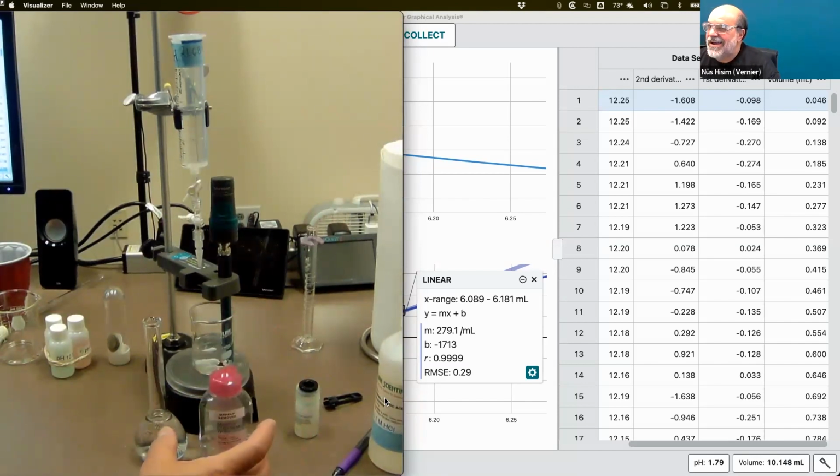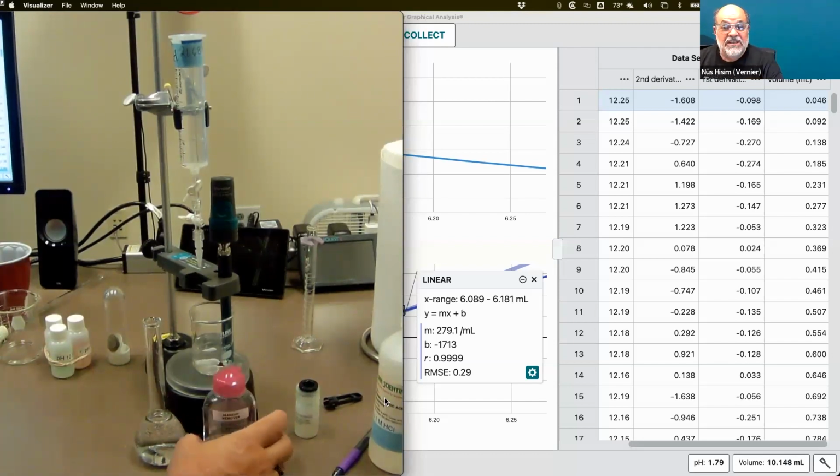I mean, these are pretty common calculations, right? But now they're doing this in the guise of being an investigator. So all of a sudden, this benign chemistry problem became a solve-the-crime problem. I used to tell my students, you are not the detective, you're not solving the crime. But once they know the volume and the concentration, they can calculate the mass of sodium hydroxide that was added to the makeup remover. So that's the gist of the whole experiment.